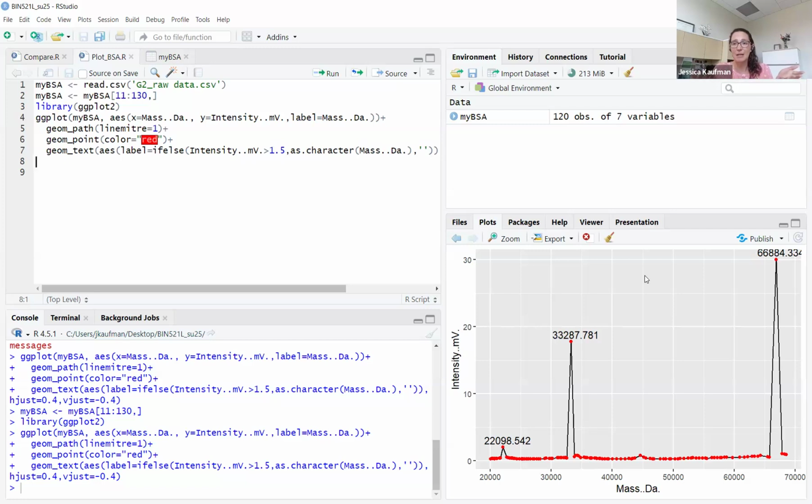Do you want the text to be this big? Do you want maybe all of the text in the figure, including the labels on the graph, the axes titles, and the axes marks, do you want all of those to be the same font? Just those little things can make it look much, much cleaner.